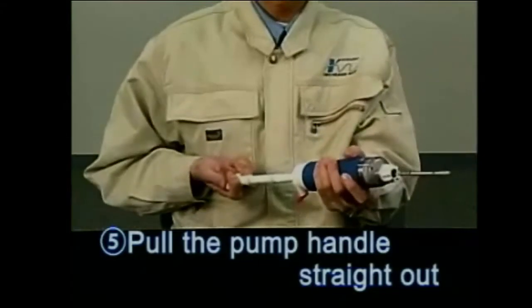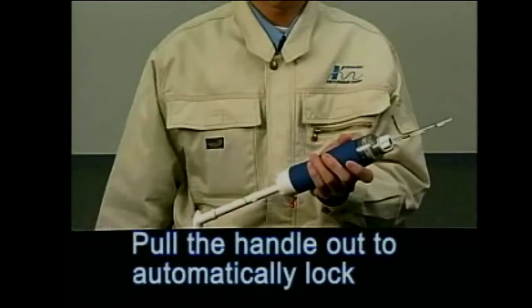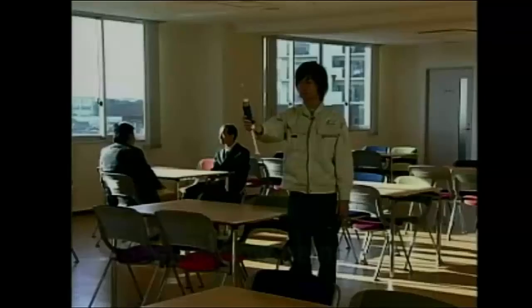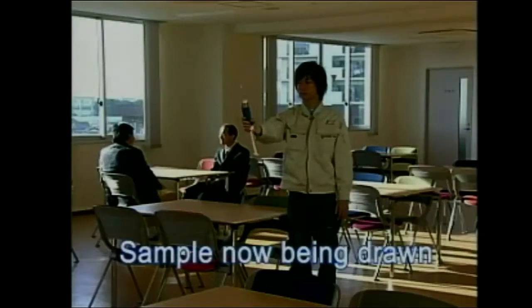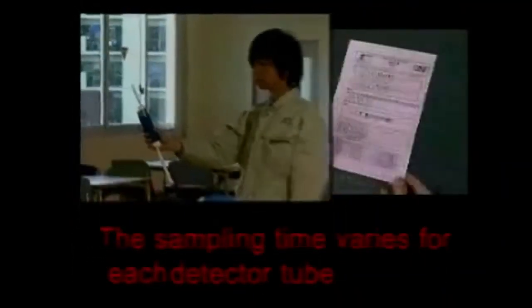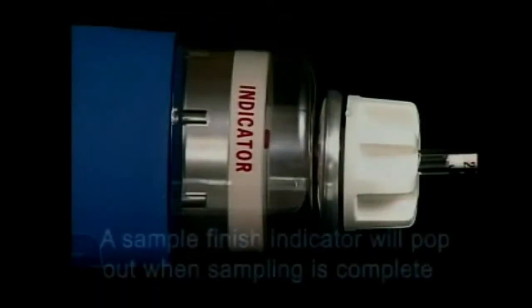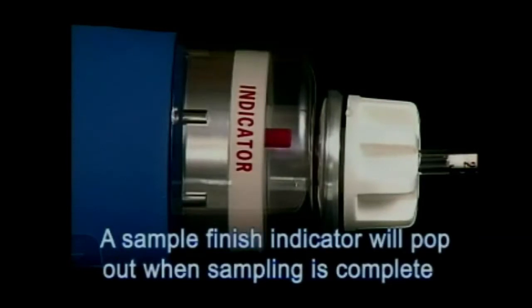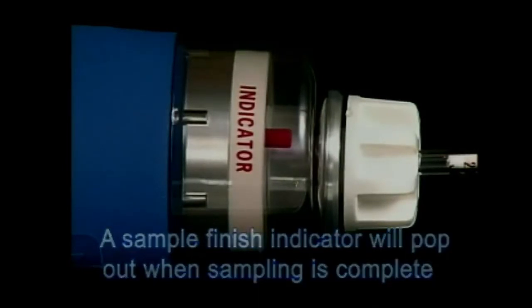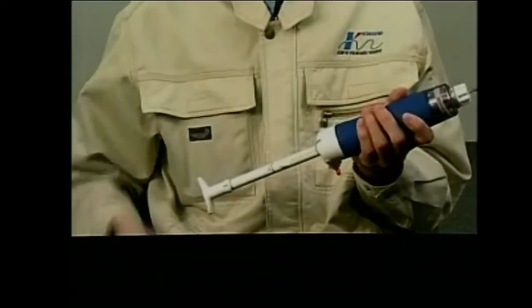Pull the pump handle straight out. It will automatically lock when it is fully extended. A sample is now being drawn through the detector tube. The sampling time varies for each detector tube model. You can find the sampling time for each tube on the tube's instruction manual. A sample finish indicator is located in the head of the pump. It pops out when the sampling is completed. Here you can see the position of the sample finish indicator during sampling and when the sampling is completed.